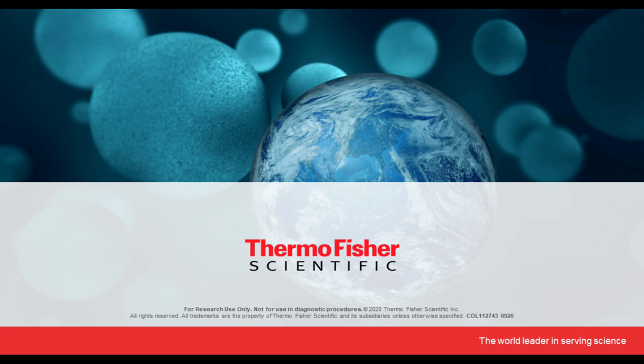Thank you. It looks like we have time for one more question. If my primary antibody detects lysine, will the no-stain interfere with my targets? So would I need to use no-stain at the end?